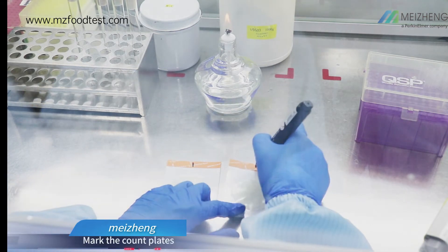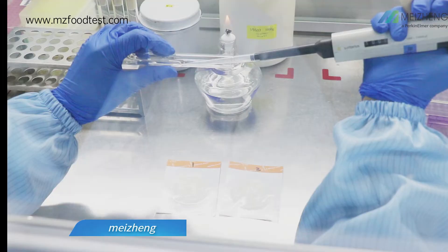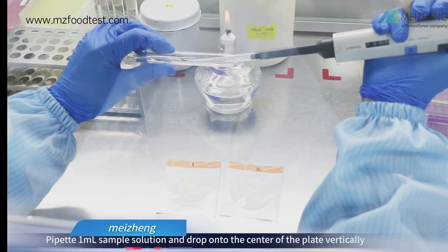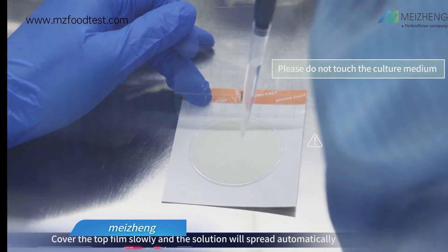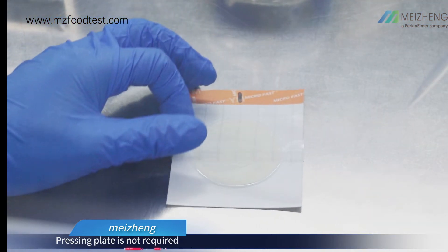Mark the count plates. Vibrate the diluent evenly. Pipet 1ml sample solution and drop onto the center of the plate vertically. Cover the top film slowly and the solution will spread automatically. Pressing the plate is not required.